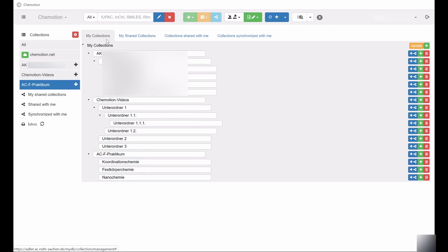Not only can you access your own collections via the upper bar, but shared collections as well.